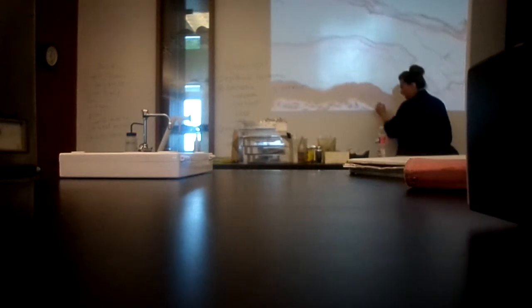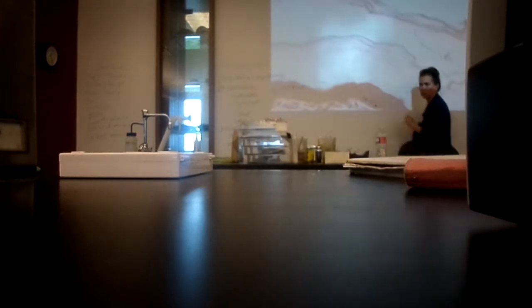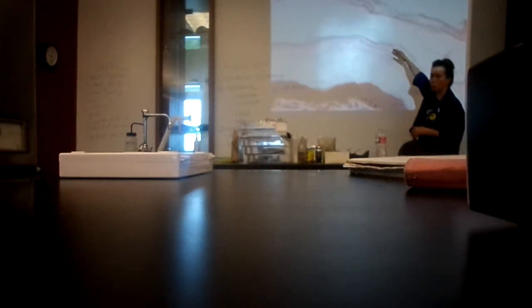But the very bottom layer will be these cells that have a nice distinct nucleus. If we're shedding our skin daily, do we need to regrow it? Yes, we replace it. And it's this layer down here at the bottom where the cells are actively dividing and pushing all of these older cells up to the surface, where they pretty much lose all of their cell parts.